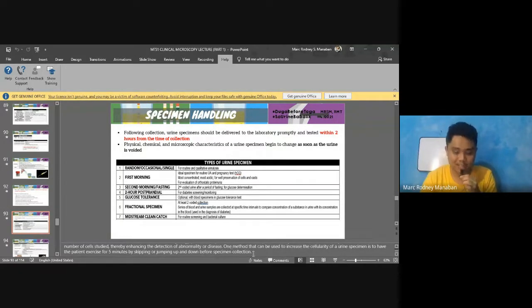So, you can isa Branzel, dears. So, imong mention clean catch if cytology ang purpose, meaning to detect the cells found in urine para makadetect ba kag mga cancer ba sa bladder or whatever, no? Ayan, dapat mainom siya water. Ayan, 24 to 32 ounces of water for 2 hours before urine collection.